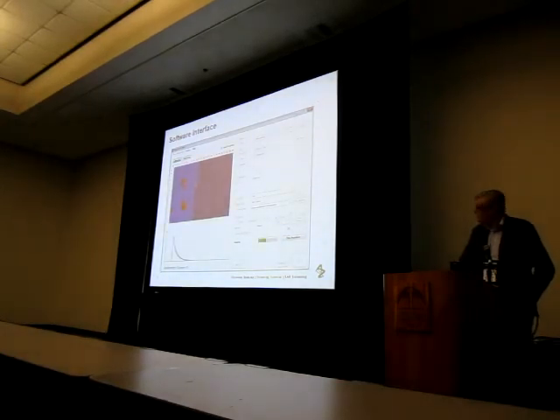There are a few pieces of information you can put in around the type of model you want to use to analyze the data, or to check that the fit is appropriate, and an output path for the data files. And really, that's all there is to it. You get a little graphic at the bottom left-hand corner, which allows you to look at the shape of the lifetime in each well as it's being read.